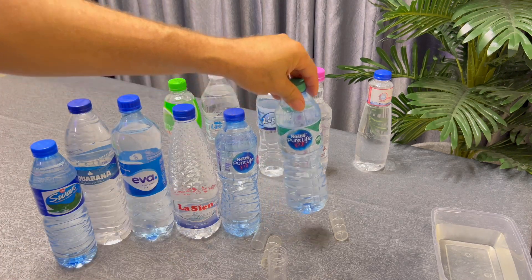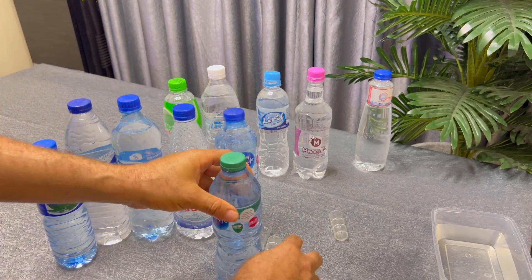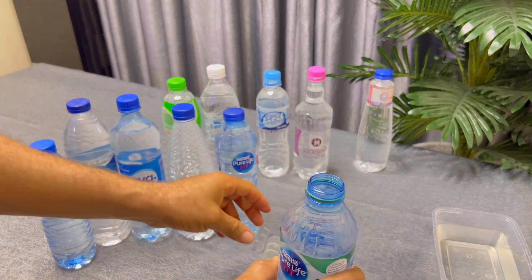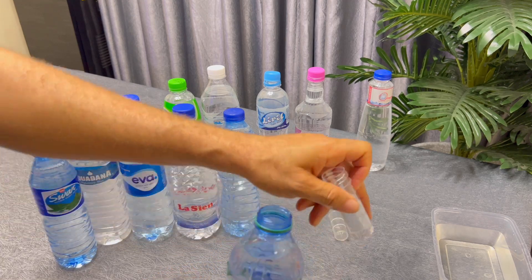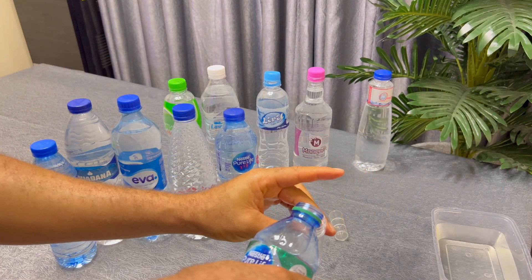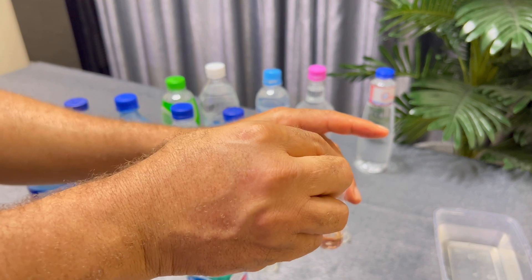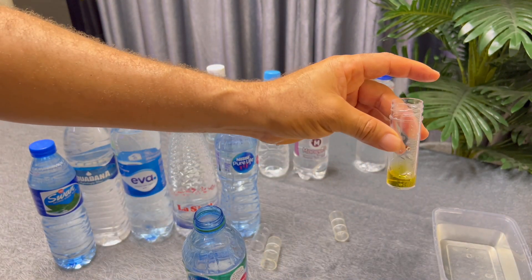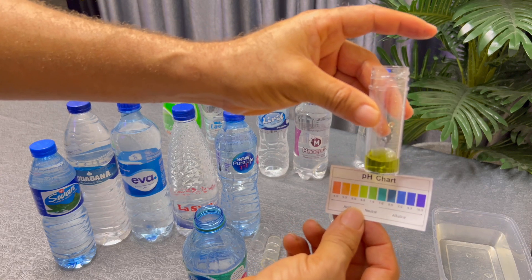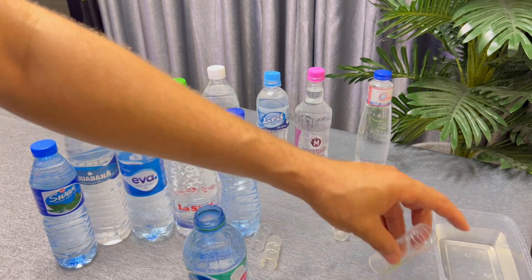Next we have the Nestle water protected with Zinc — it has the green cover. I uncork it — can you hear that sound? I rinse the test tube with it and drop five millilitres into the test tube, then drop two drops of the tester — one, two. It actually passed the test. Nestle with Zinc is neutral, pH 7. We'll trash it and take it backstage.